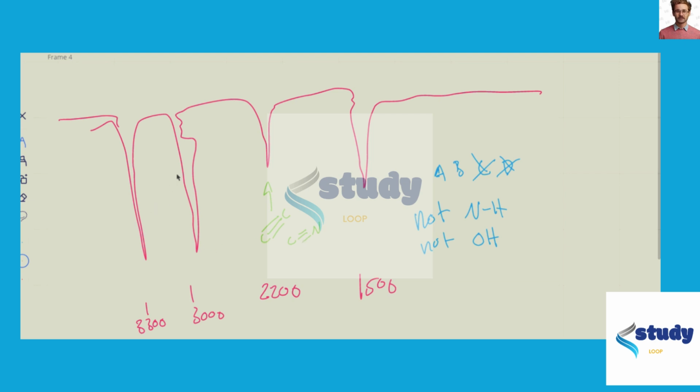Okay. What about this peak right here? Well, that corresponds to more CC stretching, or this corresponds to sp3 CH stretching, right? So like carbon, hydrogen, where there's 4 bonds here. Okay. So yeah, this doesn't tell us anything because this is present in both A and B.